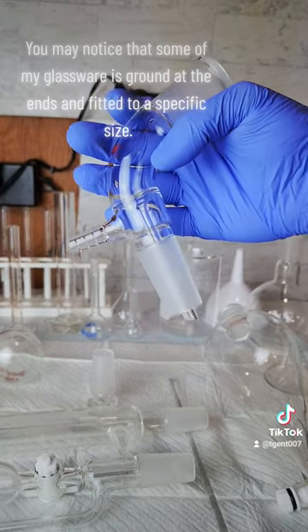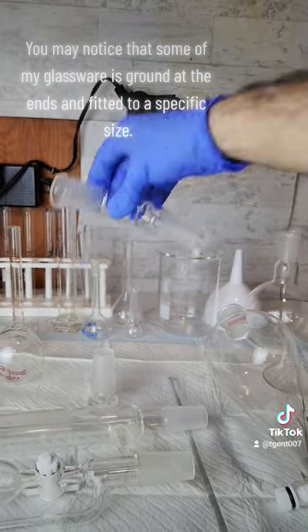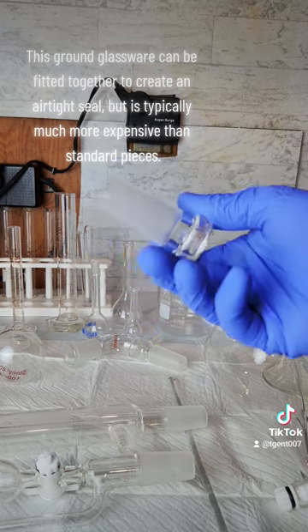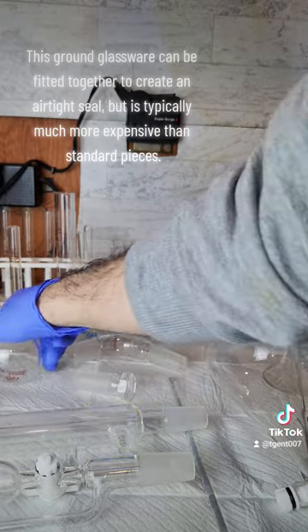You may notice that some of my glassware is ground at the ends and fitted to a specific size. This ground glassware can be fitted together to create an airtight seal, but is typically much more expensive than standard pieces.